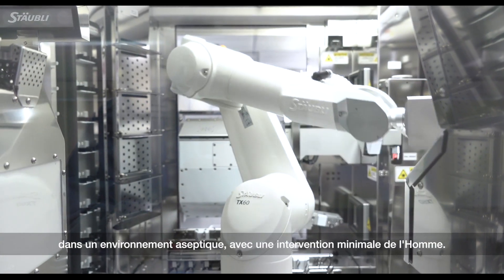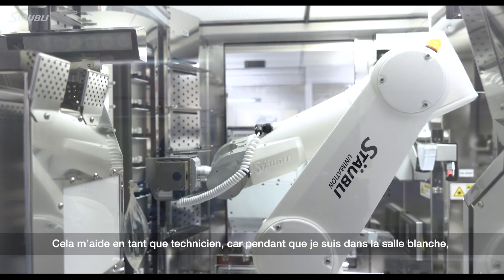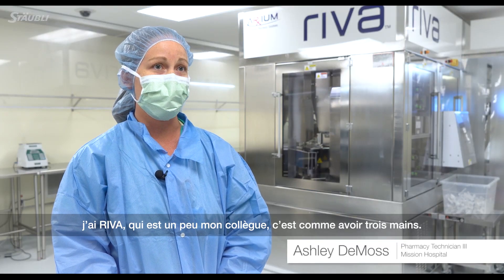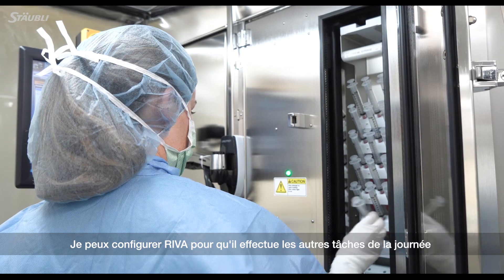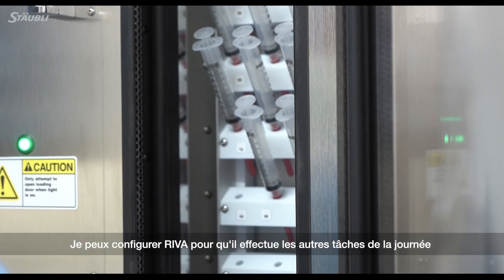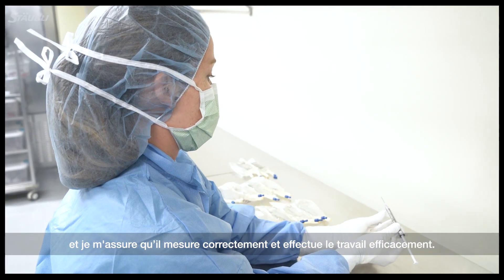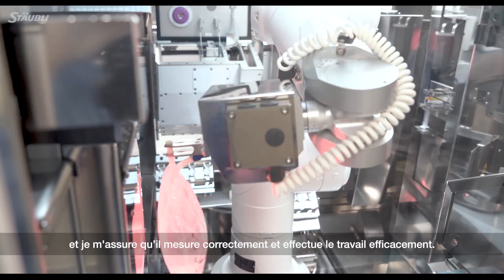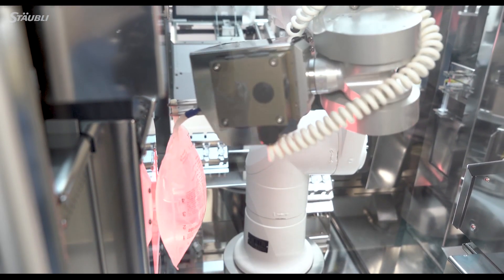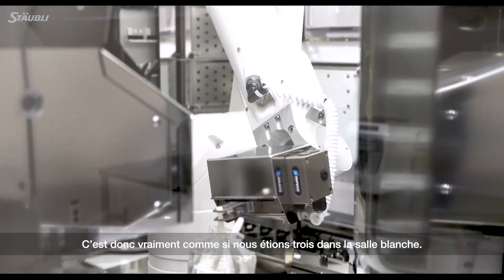It helps me as a technician because while I'm back in the IV room I have Reva, which is pretty much my co-worker. It's like having three hands. I can set up Reva to run and go off and do whatever needs to be done during the day, and be assured that Reva is correctly measuring things and getting the job done efficiently. So it's really like there's three of us — three hands in the IV room while I'm there.